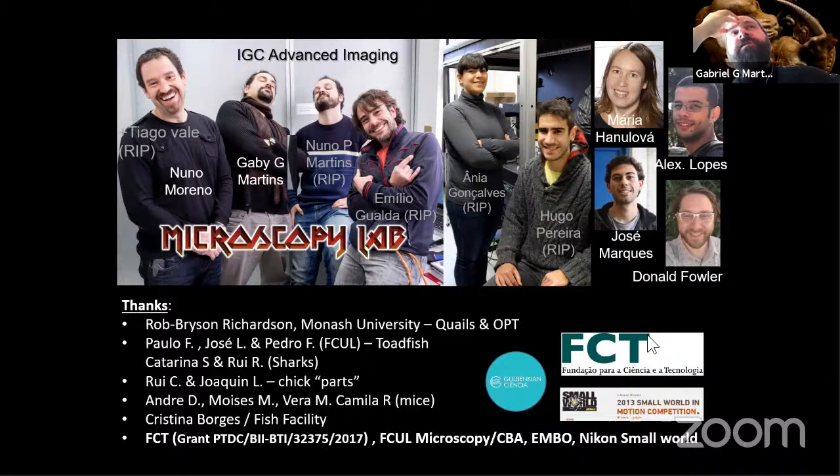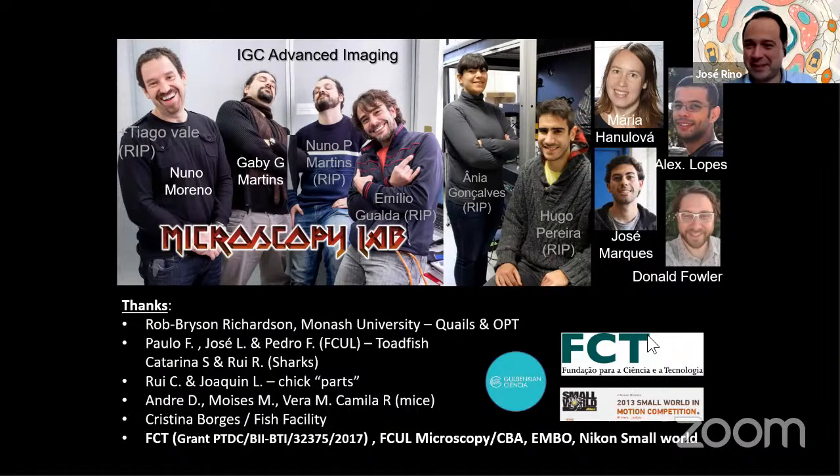And you will most likely see in a few years light sheets replacing confocal microscopes. And the story is, for some of us, that the reason why it took so long for light sheets to come out is because they were afraid of killing the confocal business. It's a technology killer, like they say. Most people would dodge buying new confocals knowing that the new light sheet is coming out and they would prefer the light sheet. And we've heard people here today mentioning that they're potential candidates for buying a lattice light sheet. So if you've seen this, you're not going to buy a confocal in the near future. You'll have very high expectations for the lattice light sheet.